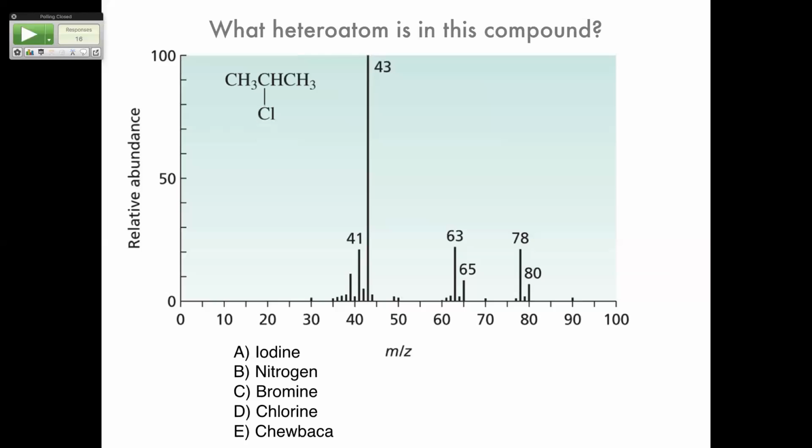The multiplet. Okay, so you see how without knowing the formula, but by using this to figure out the formula and looking at it in NMR, you can figure out what you're saying. Okay, does that make sense? Okay, so the first thing to do is figure this part out. Okay, who thought maybe there was a benzene in it? Is there a benzene in it? Why not? Because the numbers aren't high.